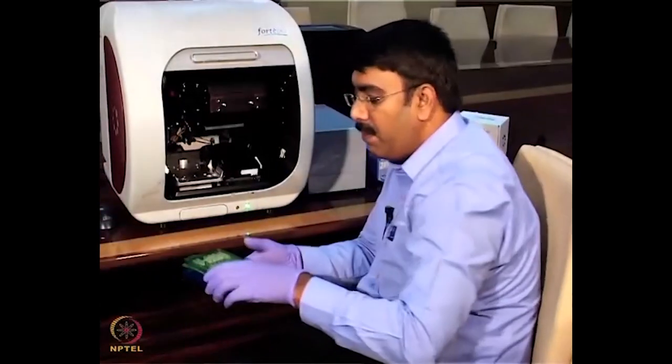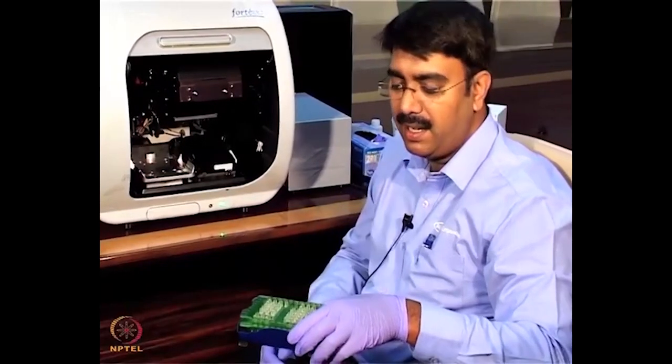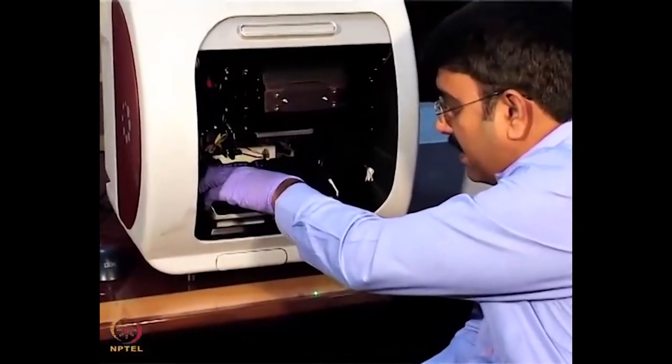So here I am going to place the sensor compartment. We can pick up the sensors from either column 1, column 2, or column 3, anywhere. We can program it according to the instrument. We are placing the sensor rack like this.